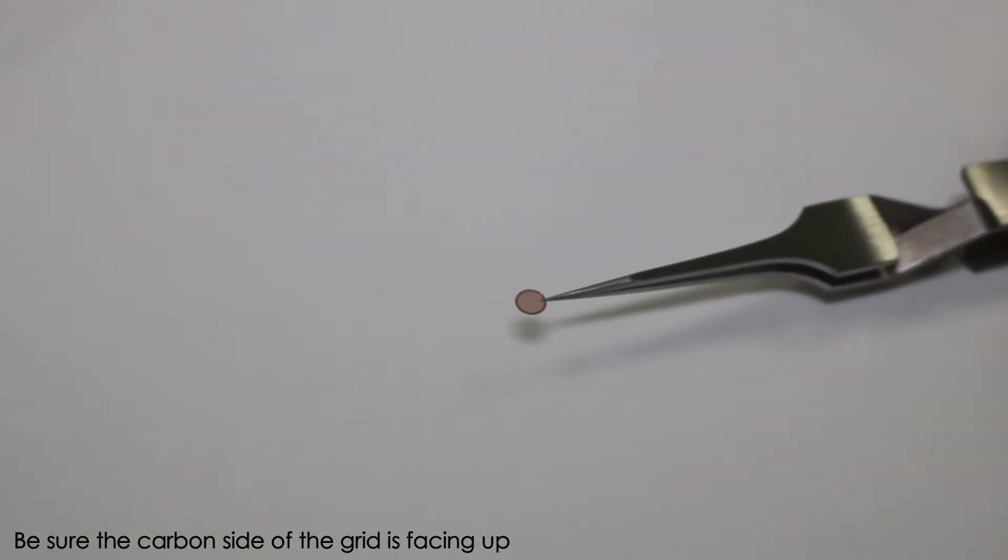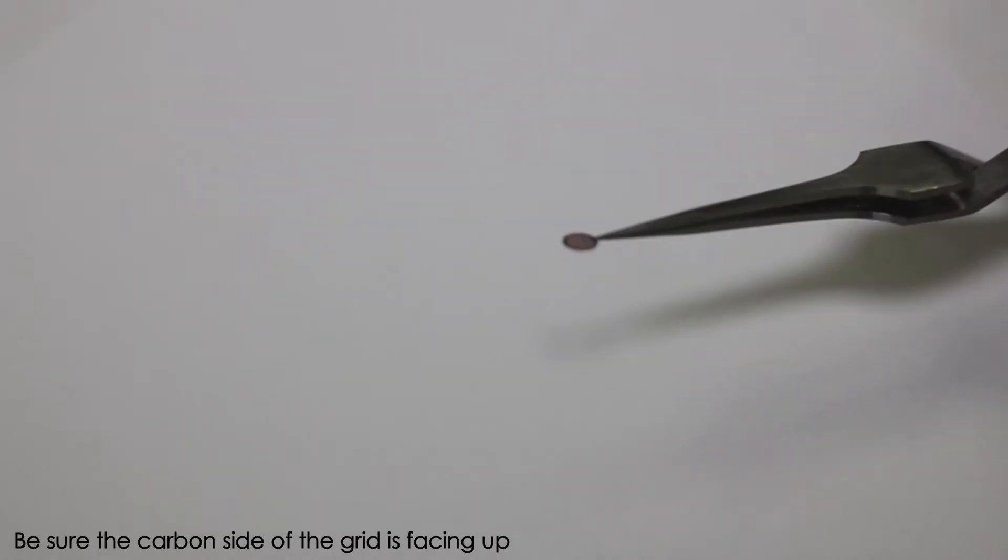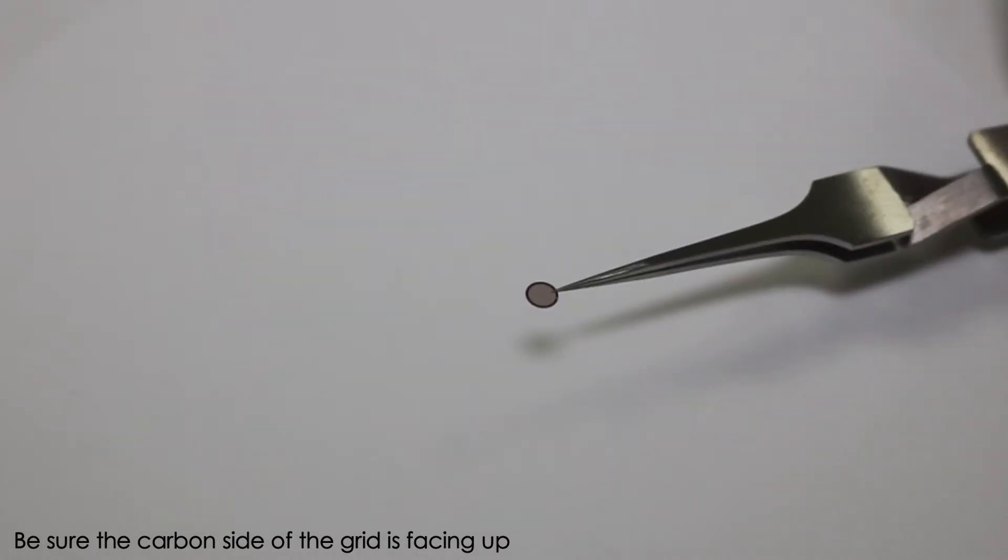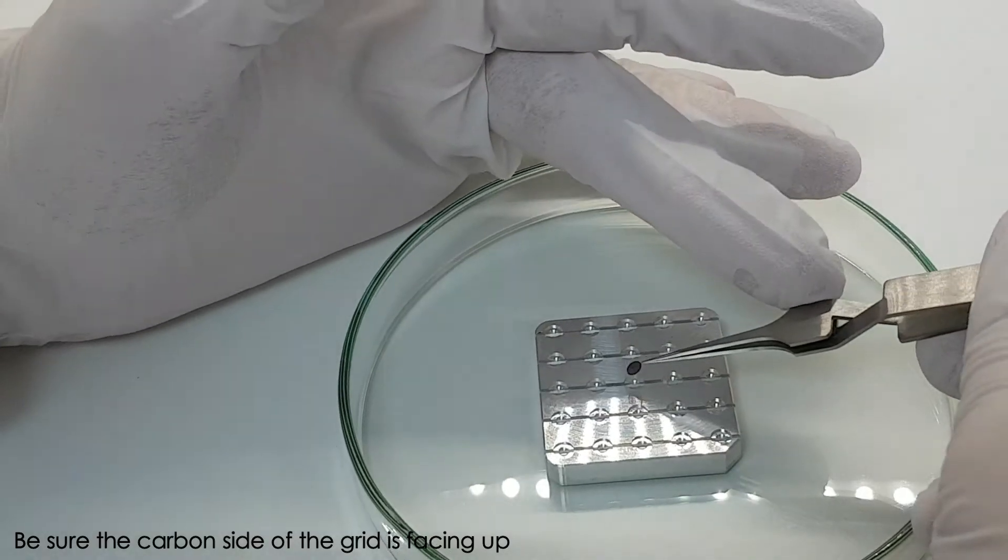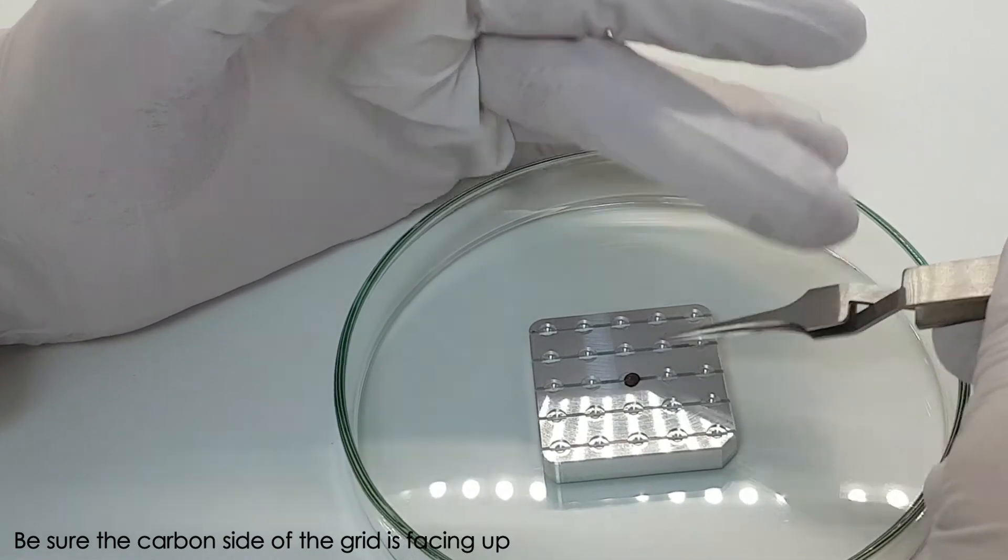Standard grids have two different sides, the copper side and the darker carbon support where the sample is placed. Be sure the carbon side of the grid is facing up.